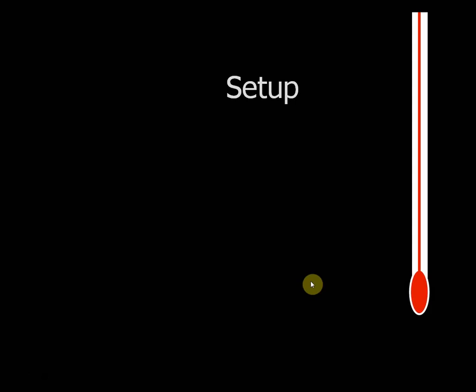To set it up, you're going to take your calibrated thermometer, put the test tube, and notice where it's at. We have the bottom of the test tube there. We have the middle of the thermometer bulb. That's where you want it to be. Rubber band it on. That can be a little tricky, so see your lab instructor if you need any assistance.